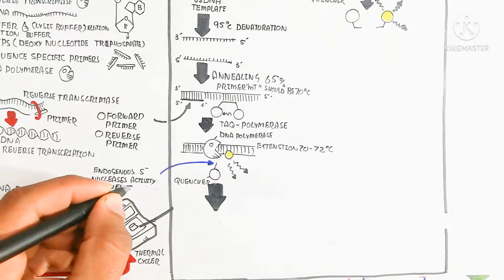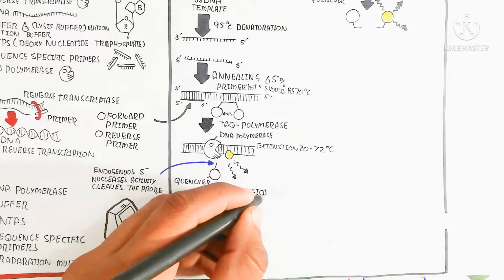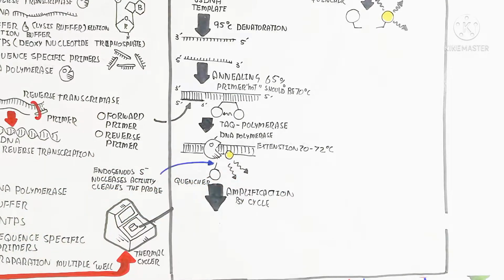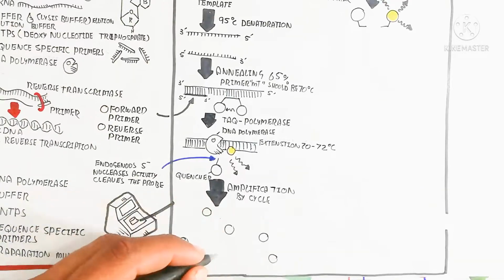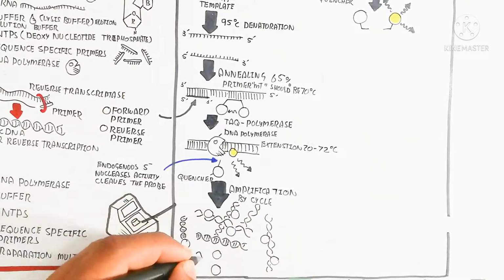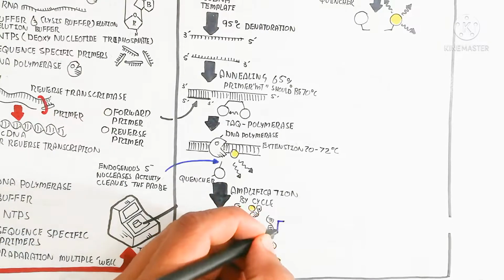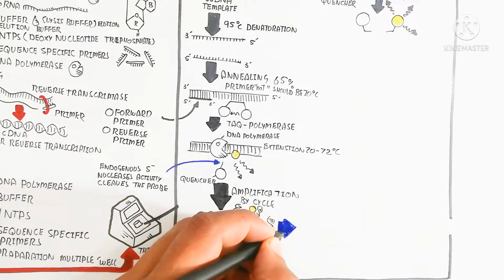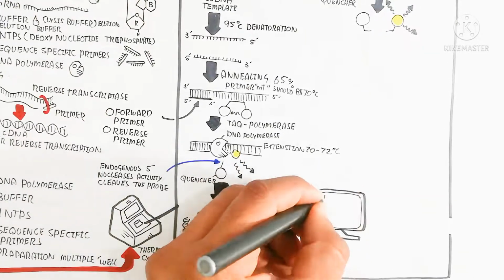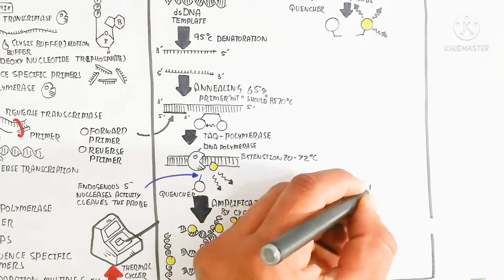So remember this. After the color production, the analytical data report will be transmitted to the computer or machine or software for detection in the graph. So if more color is produced, the detection will be positive. If the color is not produced with the specific probe, it means the genome of the virus is not present, and in this way the viral detection will be negative.